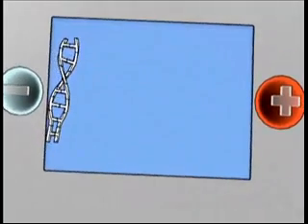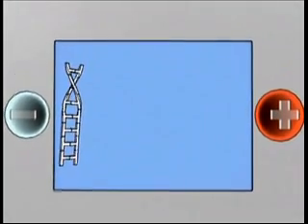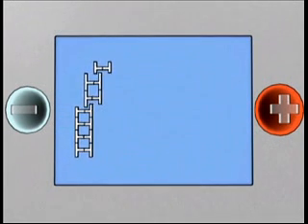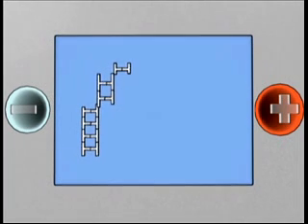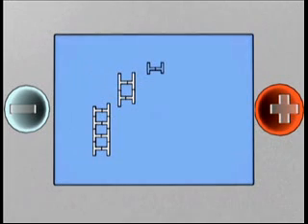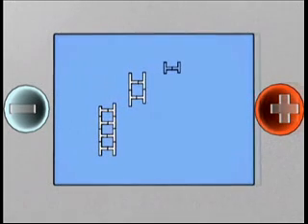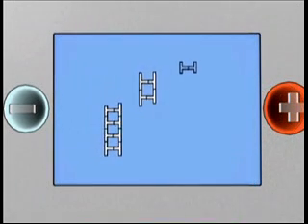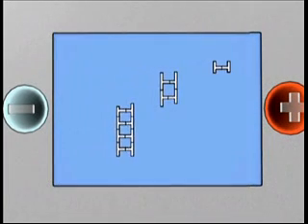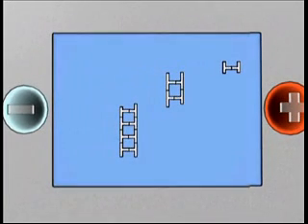towards the positive electrode. Agarose gels have microscopic pores, which act as a filter when molecules attempt to move through them. Smaller molecules will move through the gel more quickly than larger molecules. Therefore, if the electric field is applied for a given amount of time, the molecules will arrange themselves by size on the tray. Those closest to the positive electrode are the smallest, and those farthest away are the largest.